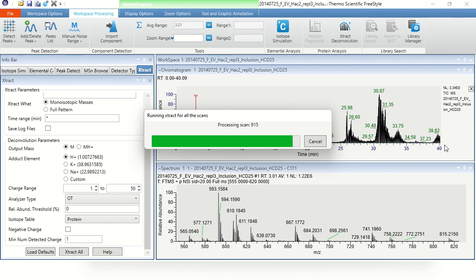So you might think to yourself, if this inclusion list included exactly 4 masses, surely what we have are a large collection of tandem mass spectra from exactly 4 masses. And I think I'm going to surprise you when I show you what actually resulted from this. I'm going to wait for Xtract to finish here before I show you that little surprise. It's almost finished. It's oh so close.